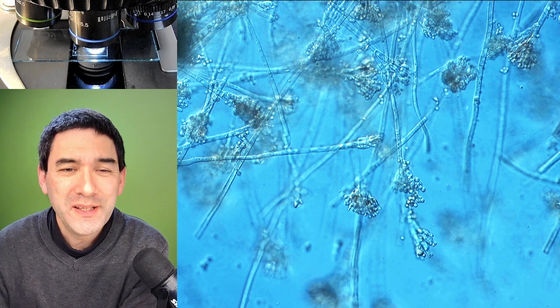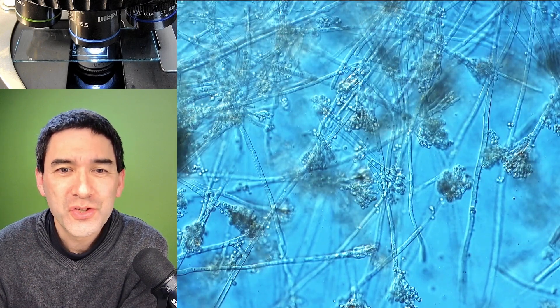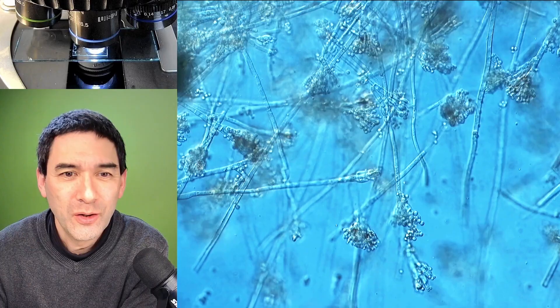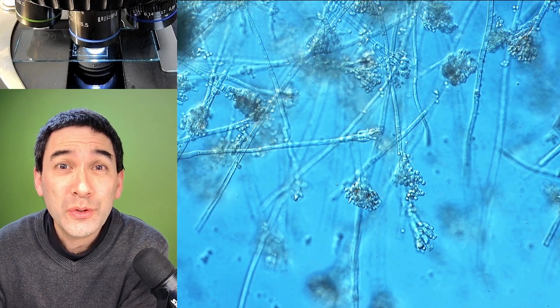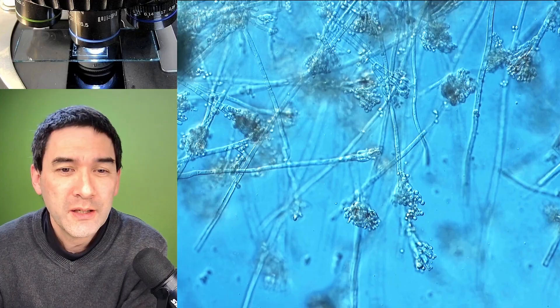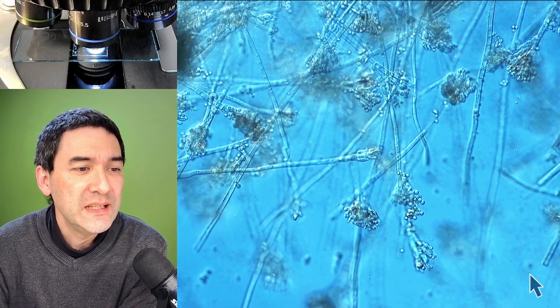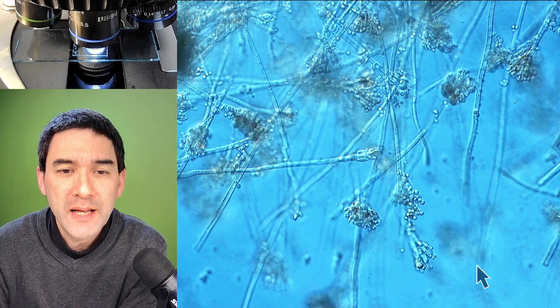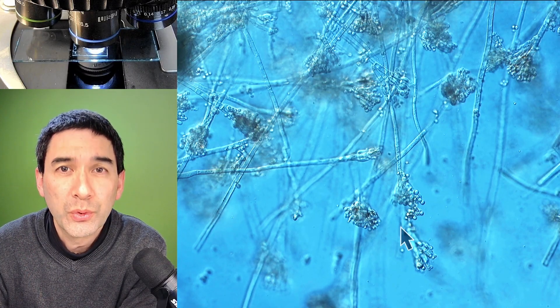I think it's quite a nice and pretty specimen here. This is how it looks like. You see those string-like cells of the mold. And yes, I cannot believe it — some beautiful conidiophores! You can see those branches over here that are extending in this finger-like manner. These are called conidiophores. And the little round dots here, these are spores.